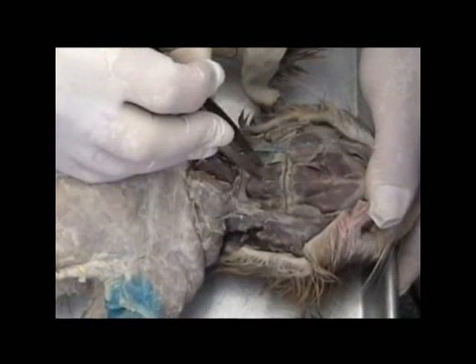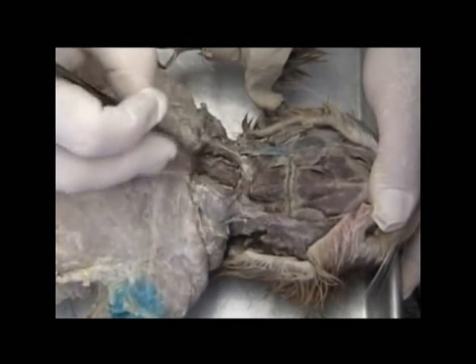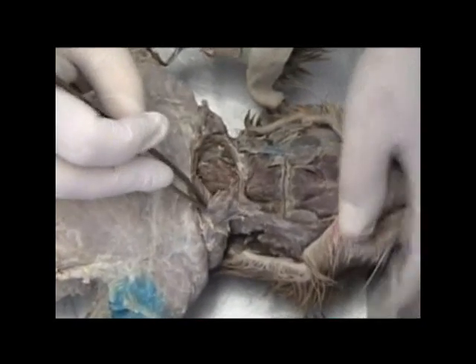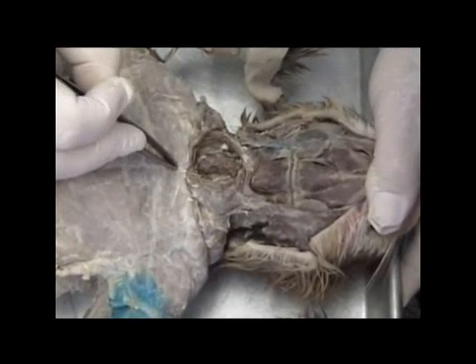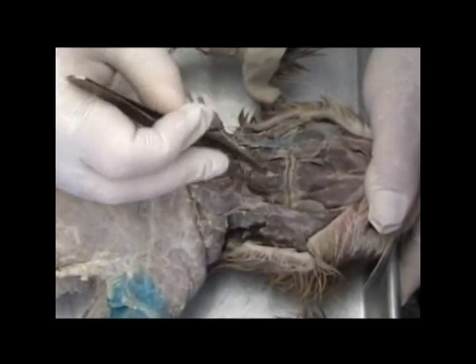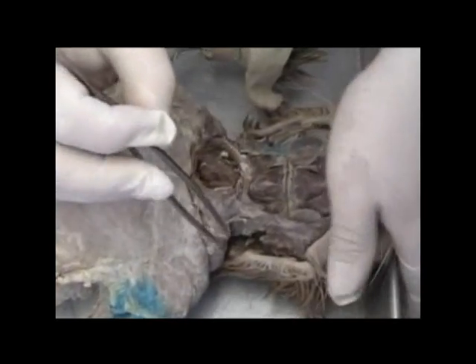So we're going to find a muscle running here and here, which actually comes down, and there's a hole here where they injected the animal and bled it out. And there are two muscles, long muscles, running from the sternum all the way up to the hyoid bone, and these are the sternohyoids, here and here.